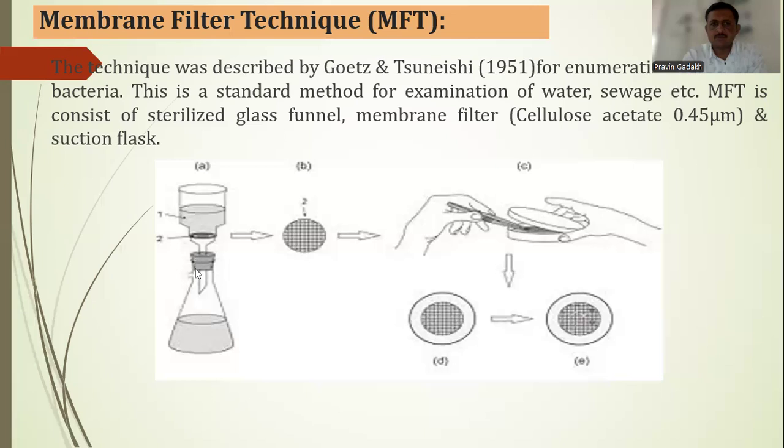Sometimes we need a suction pump, because the pores of the membrane filter can become choked and the water does not pass through the filter. So by applying suction, we can filter the water sample.